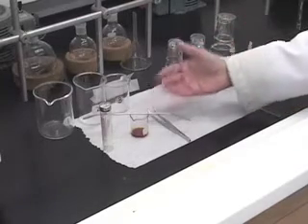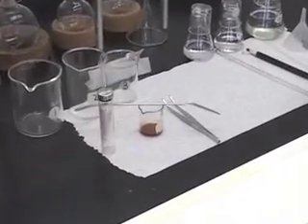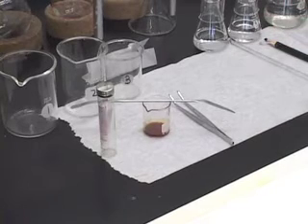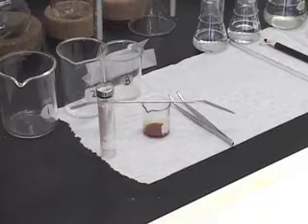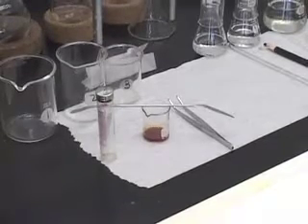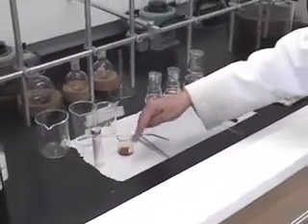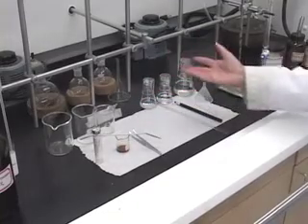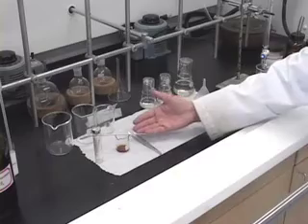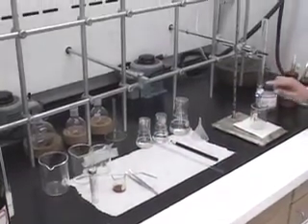That is a very small amount for separation purposes. If you are experienced then it is ok — you will be able to load that mixture onto the column without any problem. However, since this is our first time doing column chromatography, when we transfer the mixture, if you try to rinse the beaker to transfer all of it, you may end up adding too much of the solvent, and that will not give a good separation on the column.